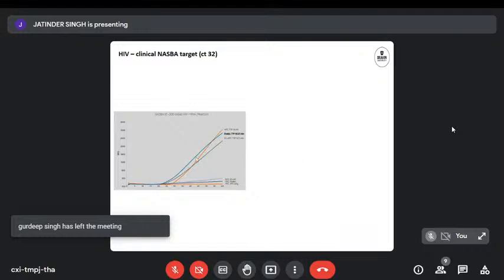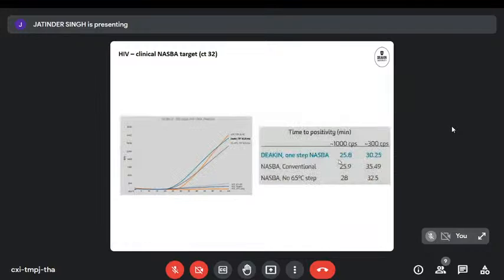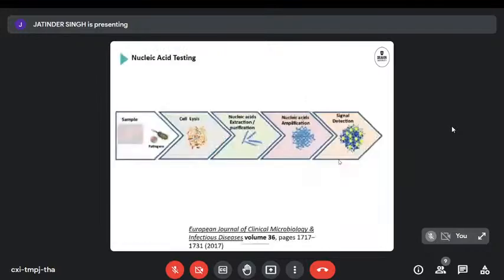You can see here that our new method, after some optimizing for HIV, using our single-strand binding protein, got earlier beyond the threshold in amplification than using this single-pot NASBA. Again, a little bit zoomed in there, and it is a lot better than using DMSO as a purely chemical way to melt the DNA. So we could get good times to positivity, and that shows you, as an example, that if there is a bottleneck in a process, you may want to either change the technology, where your bottleneck is the heating and cooling, so you develop a very fast thermocycler. There may also be enzymatic ways known in biochemistry to get the primer annealing done differently.